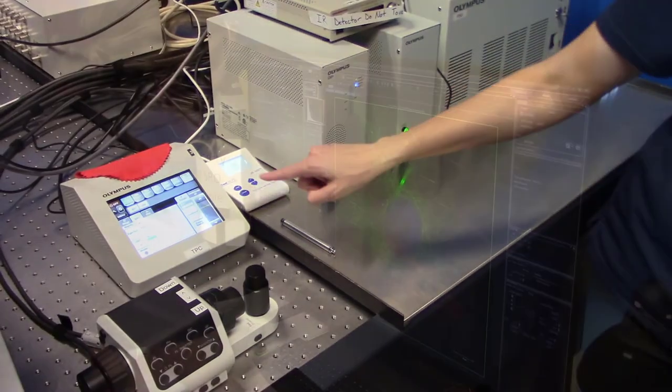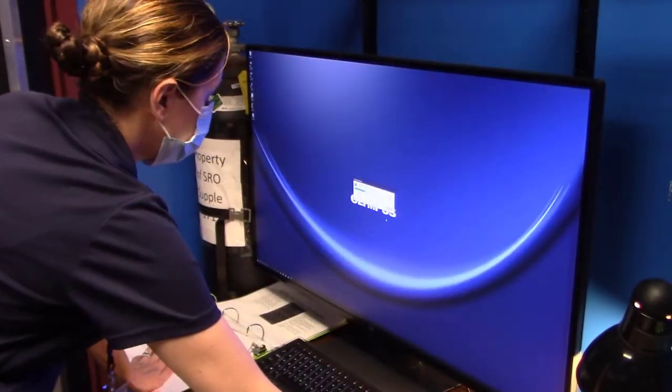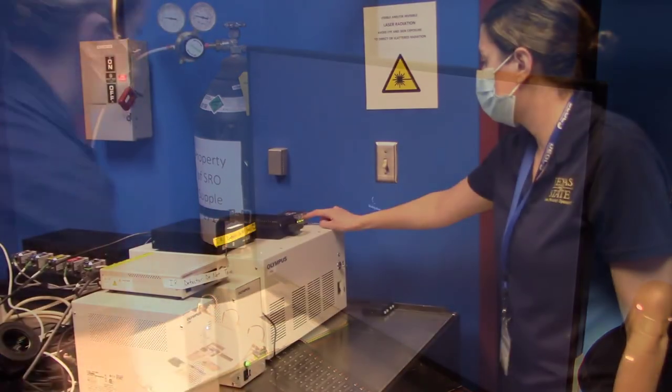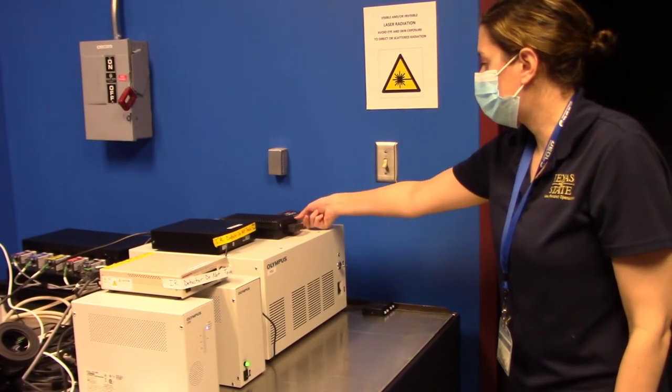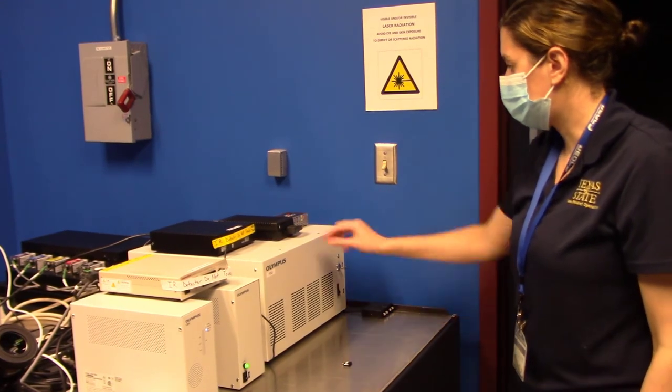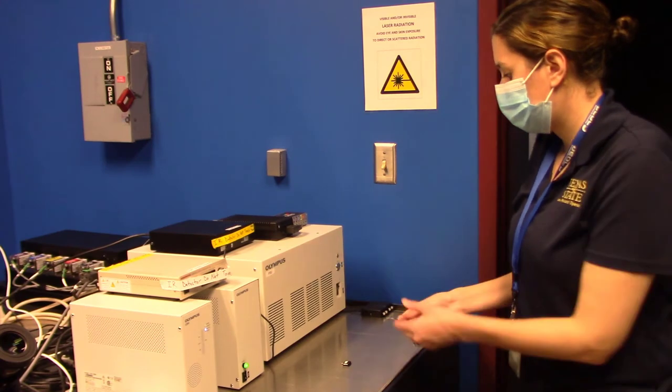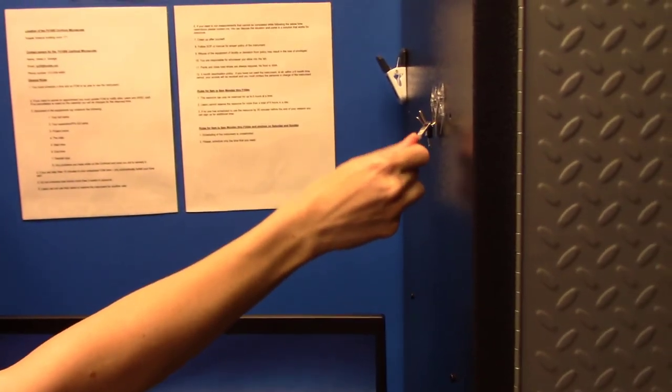Turn off the LED controller and close the FluView software. Shut down the computer, turn off the lasers, and turn the key to standby. Turn off the power source to box 6 and the tab to PSU box 5. Turn the PSU key number 4 to off. Hang the key number 4 and number 7 on hooks located on the side of the metal cabinet.